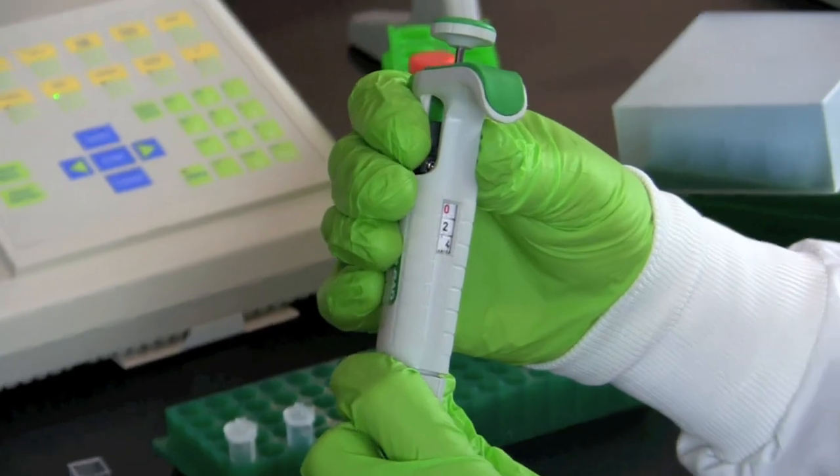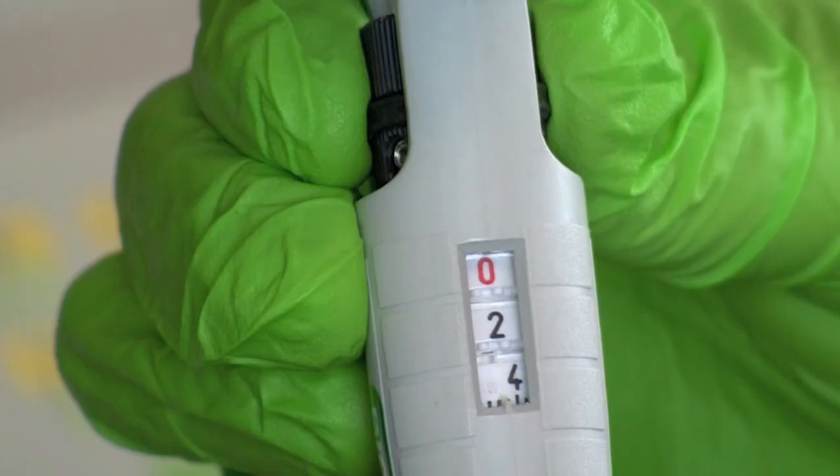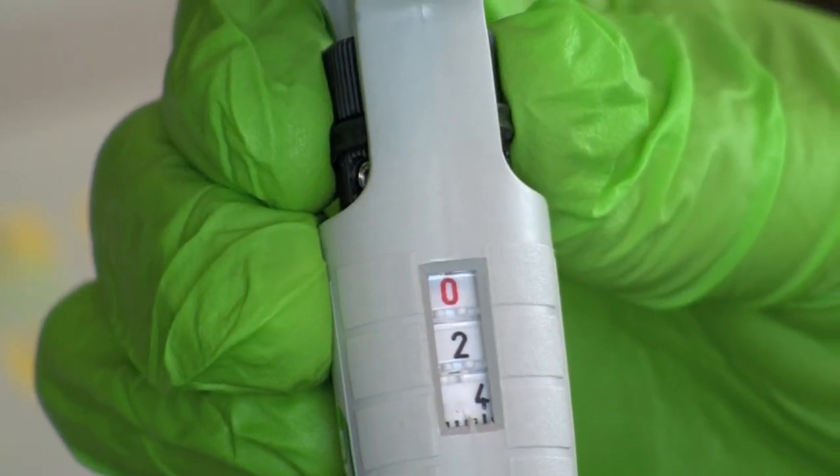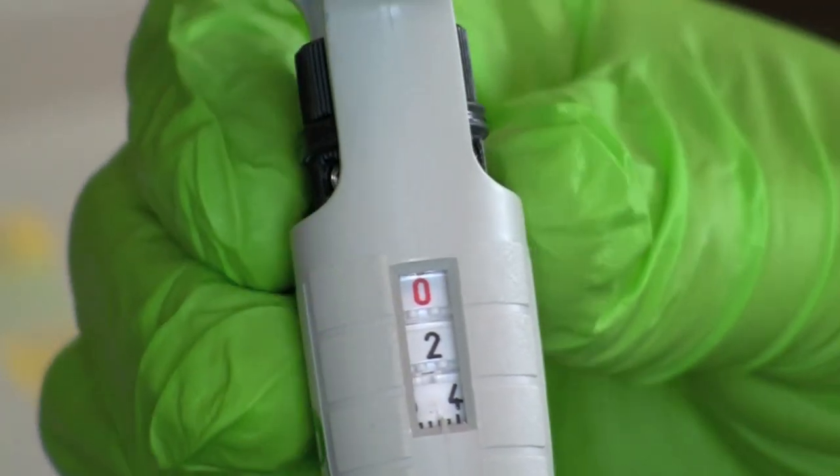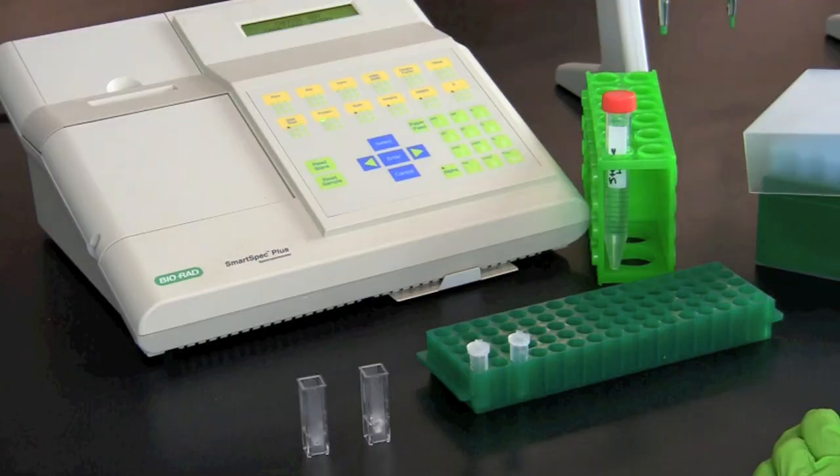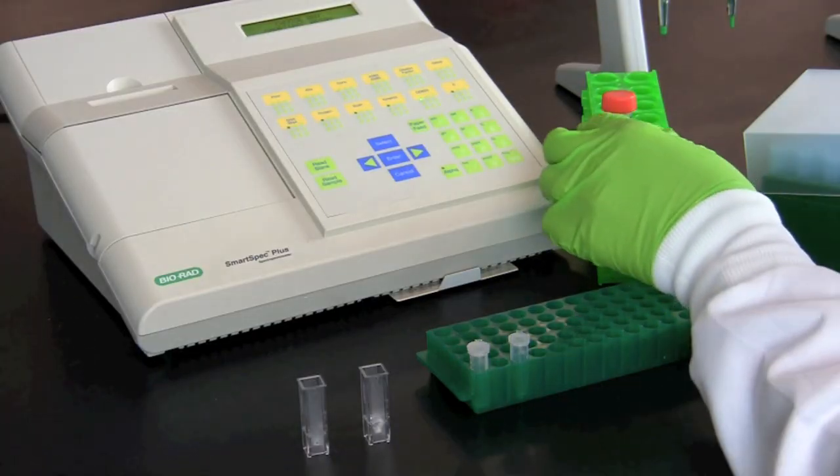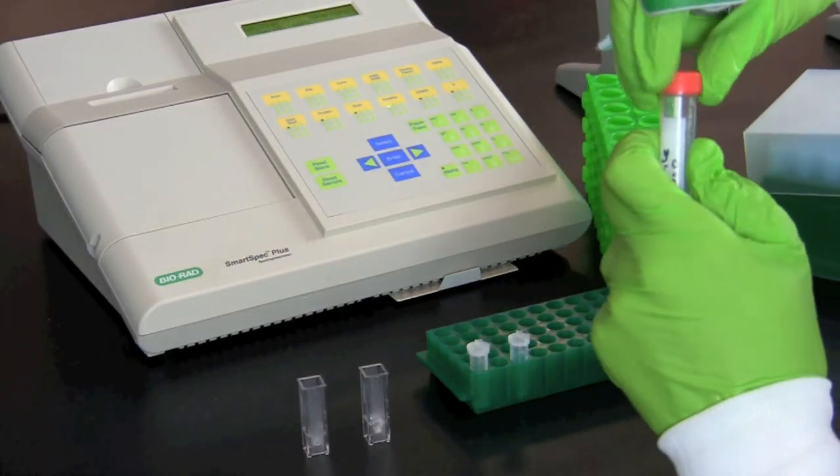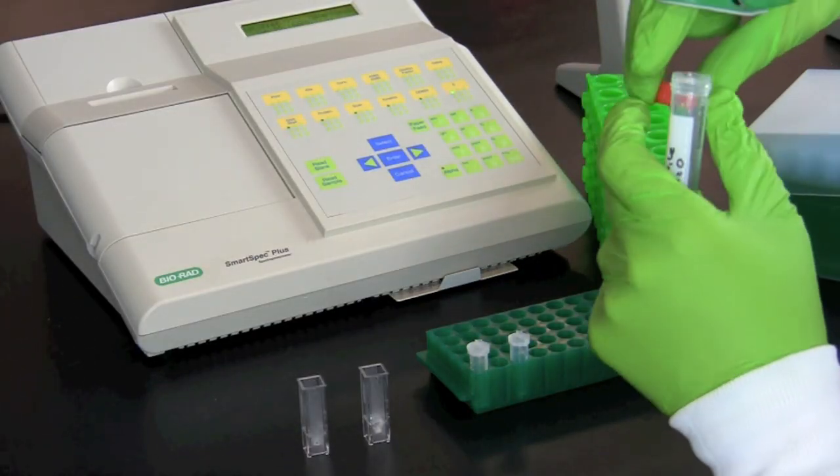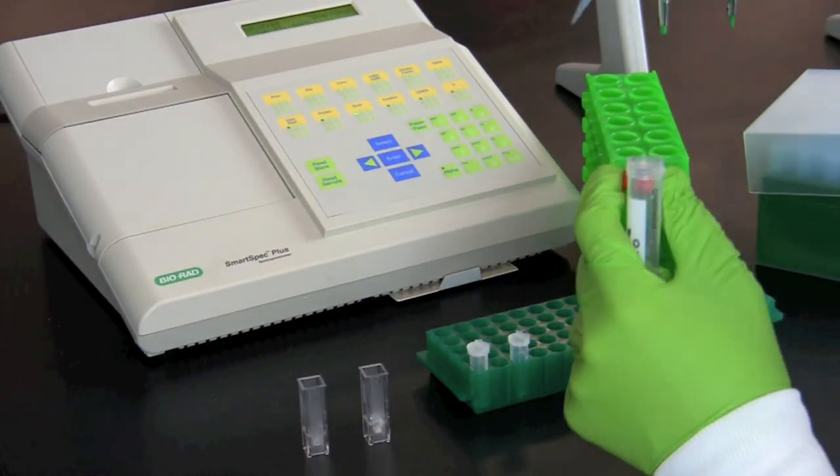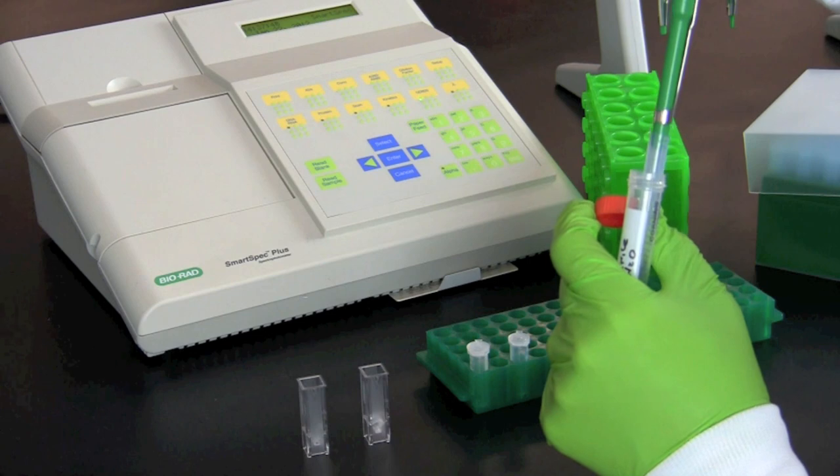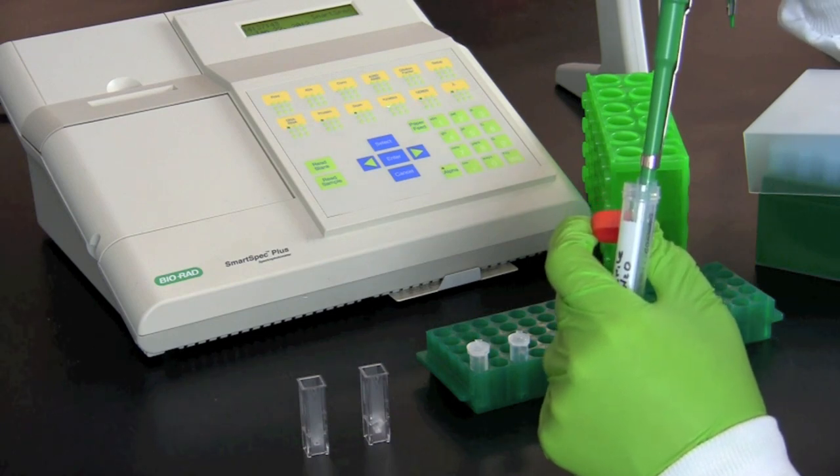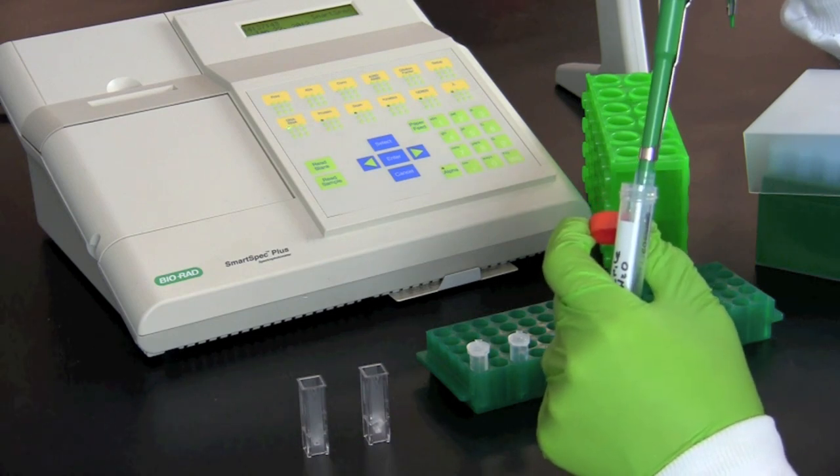Set your micropipette to 245 microliters. Pipette 245 microliters of distilled water into both cuvettes.